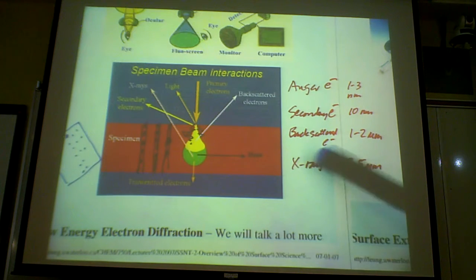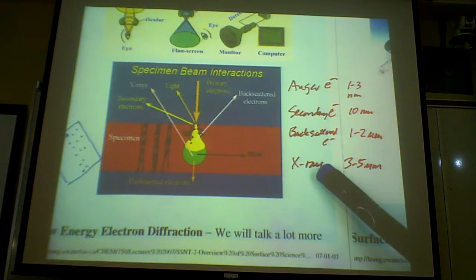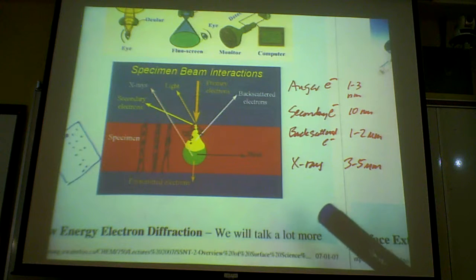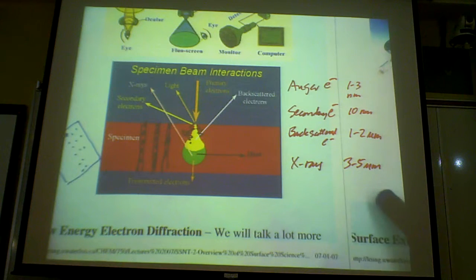Therefore, you would have photon emission at different positions, different wavelengths. This can be used to identify what kind of material you have. This is known as energy dispersive X-ray analysis, usually given the word EDAX, and basically is X-ray emission.